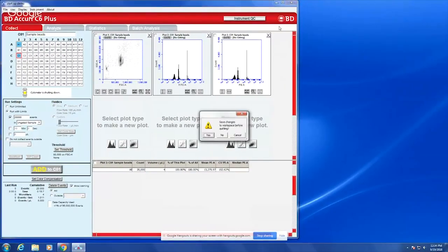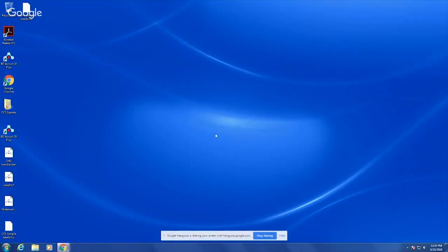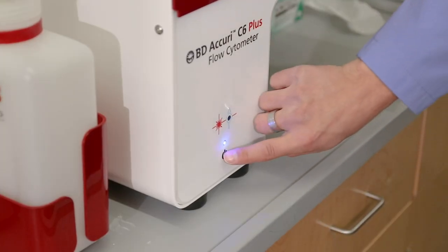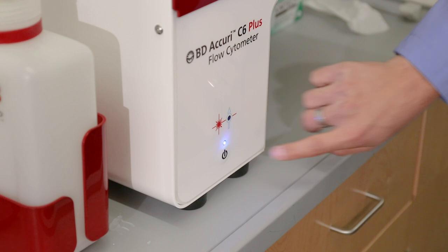After that is finished, close the software and log out of Windows. Press the power button on the front of the cytometer once to initiate shutdown. This requires the water tube to be on the machine with at least two milliliters of water.